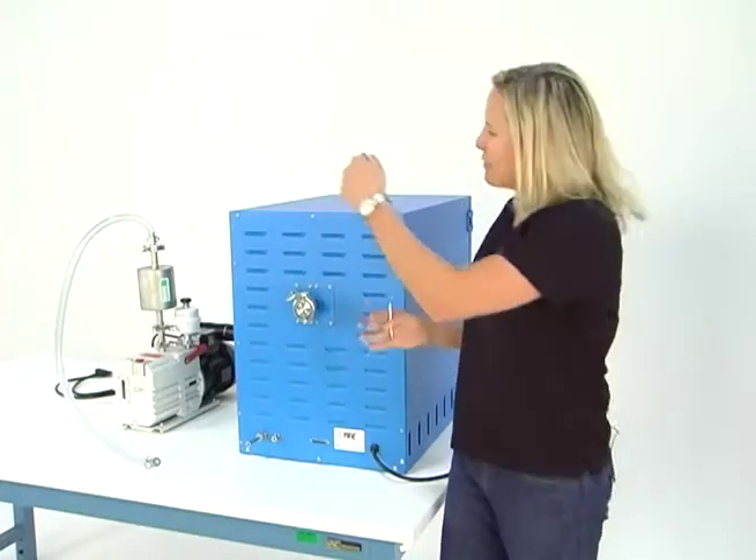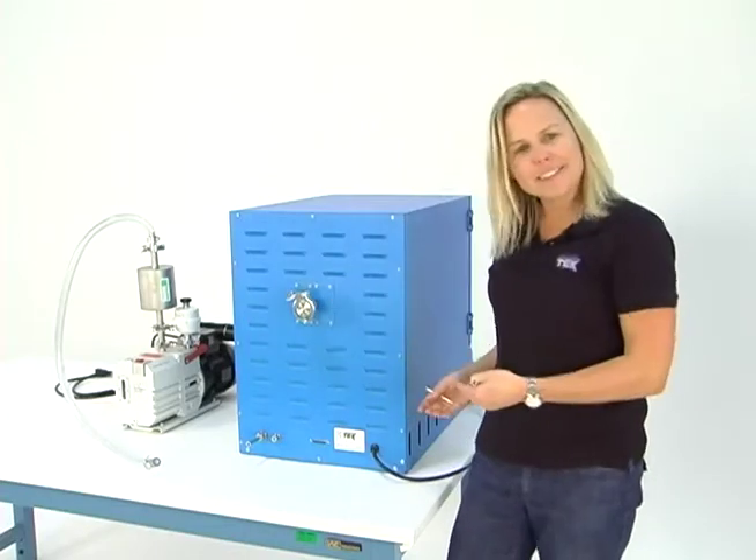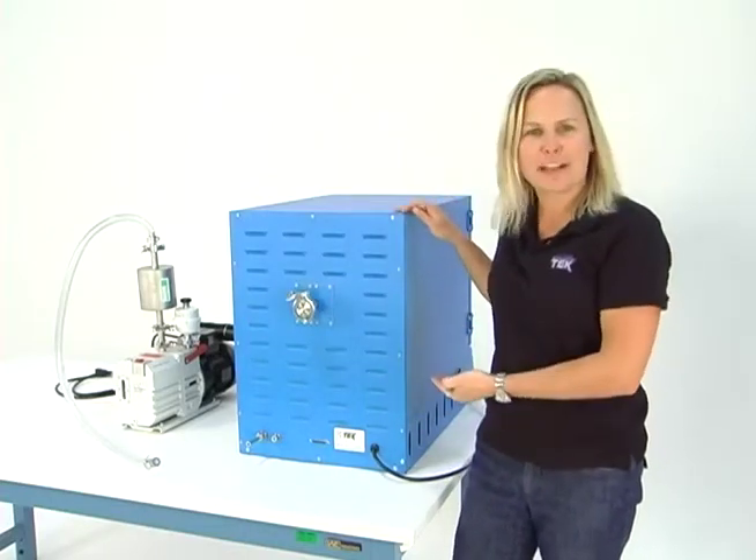Okay, everybody. Now that we have got our pump connection kit connected to the pump side, let's connect it to our actual vacuum oven.